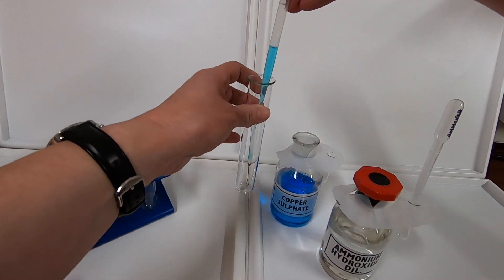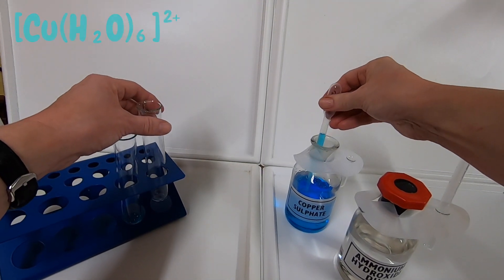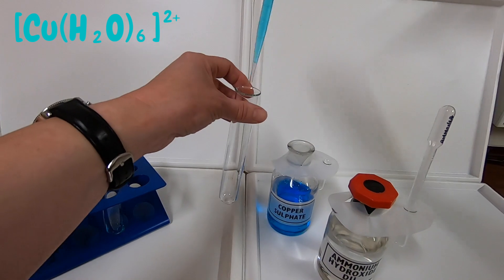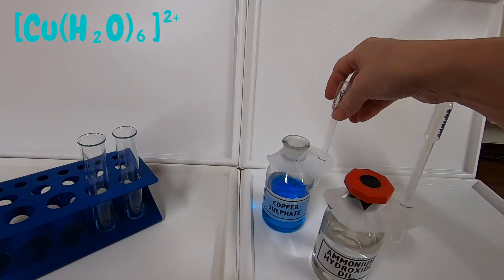In this video, we are going to use aqueous ammonia to demonstrate ligand replacement in hexa aqua copper two ions. Those hexa aqua copper two ions are found in the copper sulfate solution.